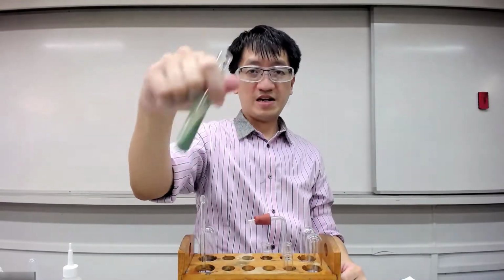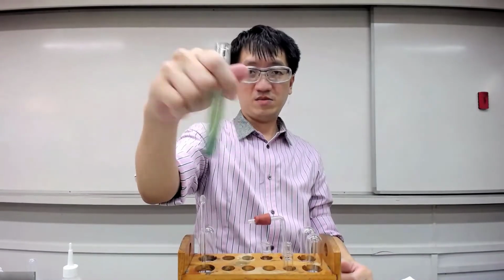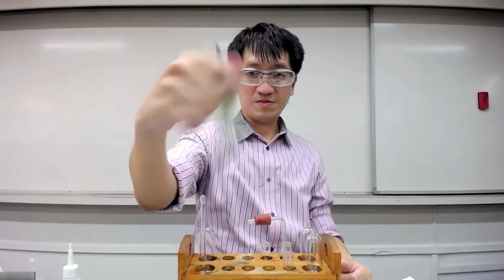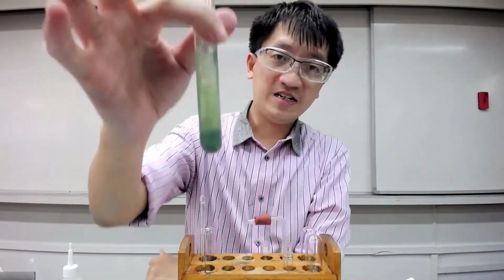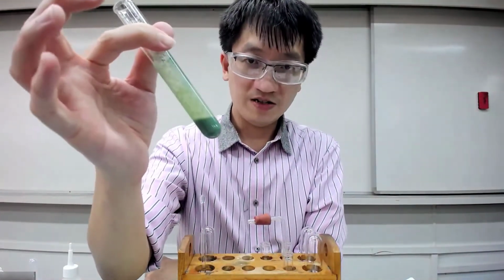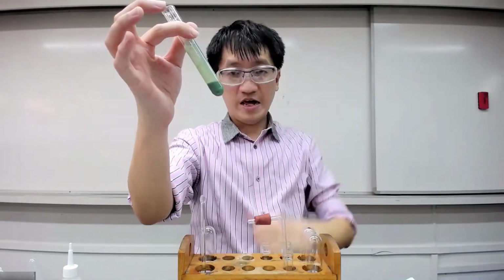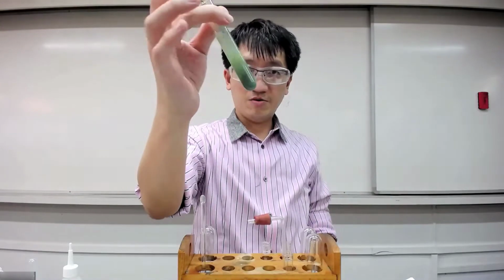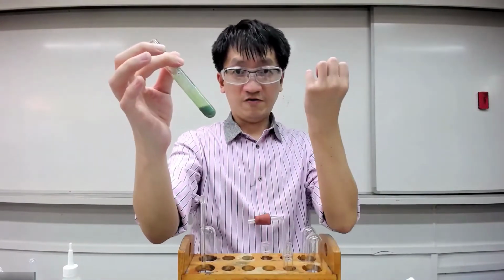Okay, so this is a good technique that you probably want to learn. So one way is you swirl hard, and then another way is like this. Okay, yeah, so this is the final appearance of the solution, which you should observe in your lab worksheets. So this is probably written as the green PPT, and then just now you observe effervescence.